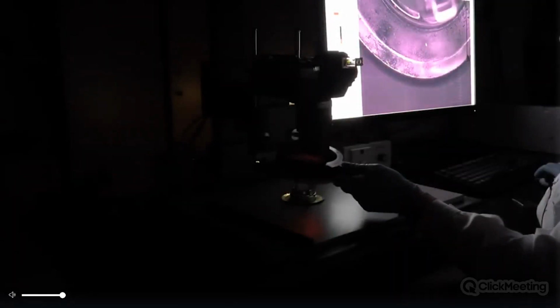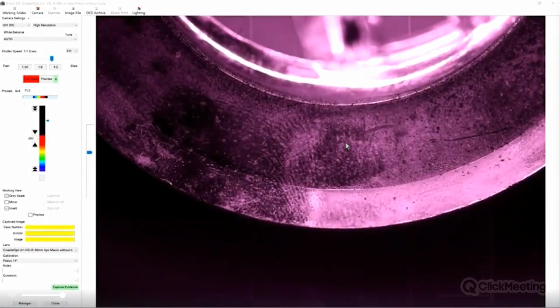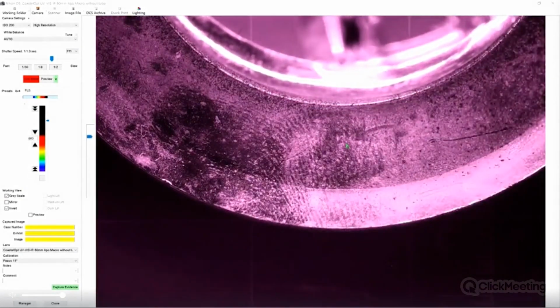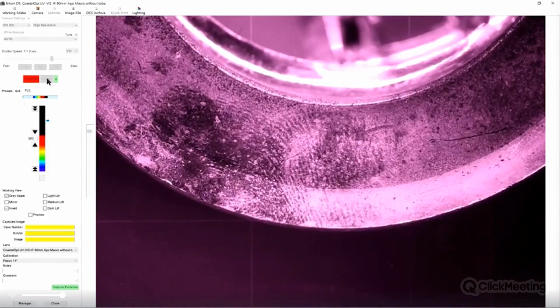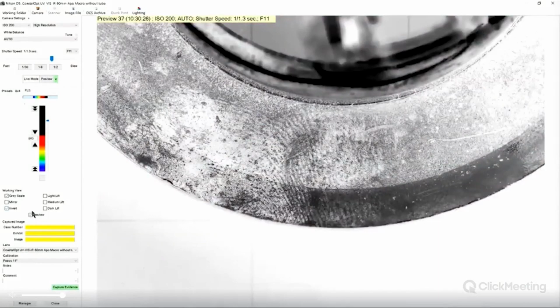Okay, so what we've done now is we've actually just reversed the light fitting, so we're now looking at the opposing side. Still using dark field illumination with infrared light from our FLS. We can very clearly see a lot of ridge detail now coming into focus. So we'll take a quick preview. Before grayscaling, we can see our ridges here, along here.